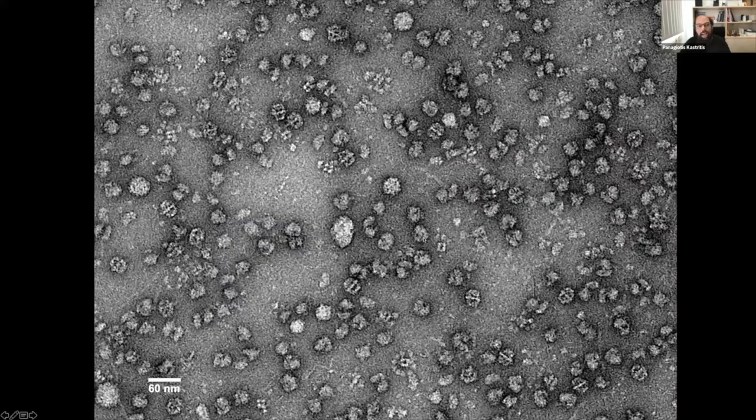So here is another image that is the first image that I acquired here in Halle, where I'm a junior professor for cryo-electron microscopy. This is a negatively stained image, and you can see here this kind of cell extract complexity. You can see very nicely with high contrast, because we use the stain here to understand what is there, of different molecules, like here again the hamburger shape, fatty acid synthase, but also a lot of other macromolecules forming this kind of higher order assemblies together.